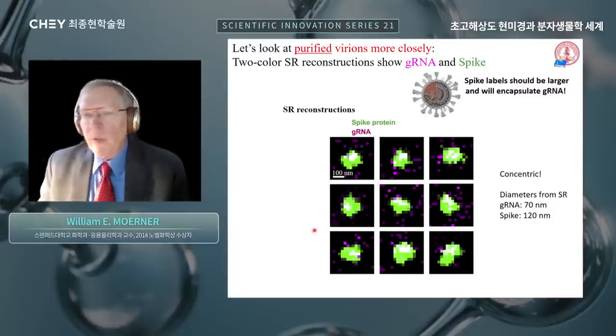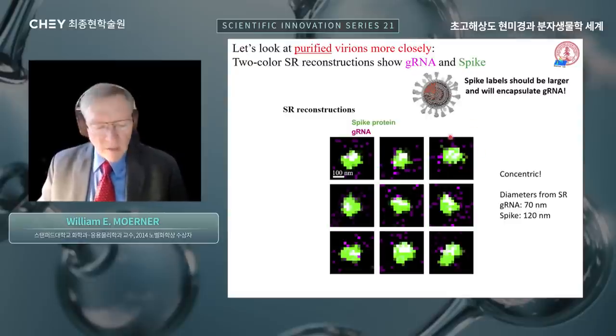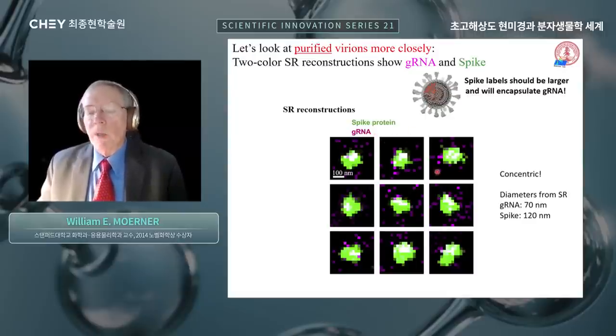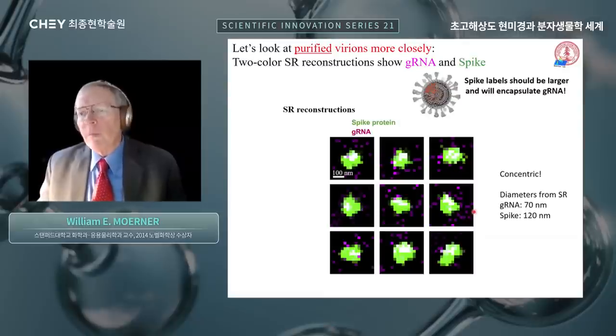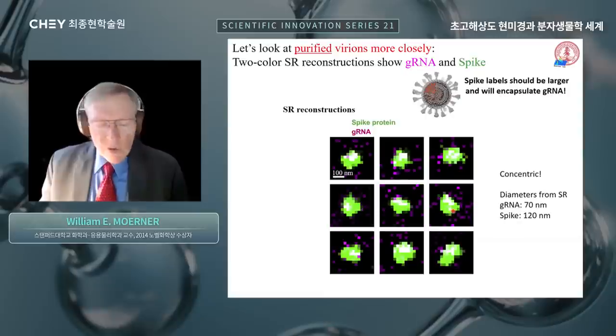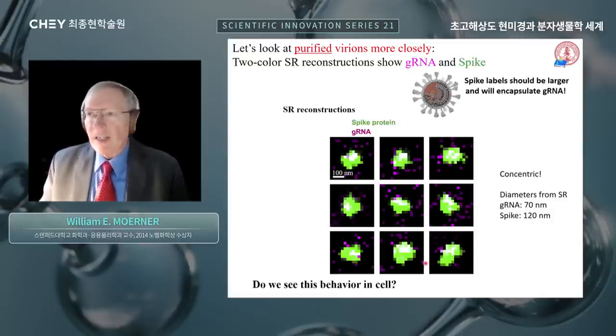Note that while there can be lots of different kinds of imaging of viral particles, let's say by electron microscopy, you don't know exactly what is inside. But here, we have specifically labeled this gRNA with those FISH probes. And so we know that these objects inside are, in fact, genomic RNA, as they should be, of course. It's not really a surprise. But the point here is that this super-resolution microscopy, I said it has high spatial resolution. And indeed, it does. These resolutions are on the order of 10 nanometers. This is much, much better than 250 nanometers. But it's not one nanometer. Don't expect it to show every single molecule and every single atom of each one of the proteins. But there's still information available by doing this.